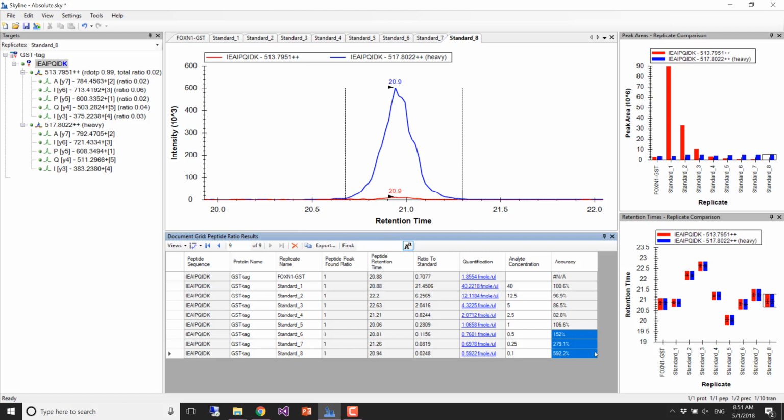And that gives us some insight into the fact that we actually expect a lower limit of detection. So we expect that once we hit the lower limit of detection, the points will curve, and it will stop having linearity.